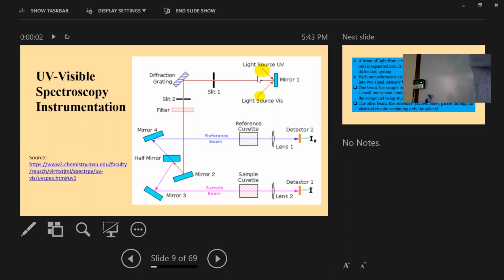As I am holding one hand my pin and another hand is a pointer, it should be like this way. One side, some portion is bright, some portion dark. Bright, dark, bright, dark, like this. So this is dark, this is dark, this is dark, and the other side also like this. It should be like this one.